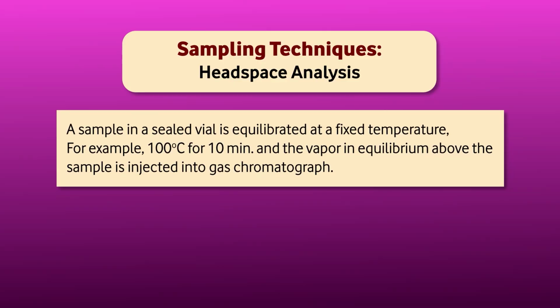What is headspace? Headspace is the sample which we have prepared. We take it in a sealed vial. In the sealed vial we put the sample and we equilibrate it at a fixed temperature, say for example 100 degrees or 120 degrees, depending on what sample we are doing.